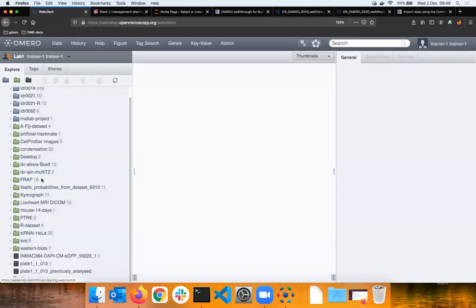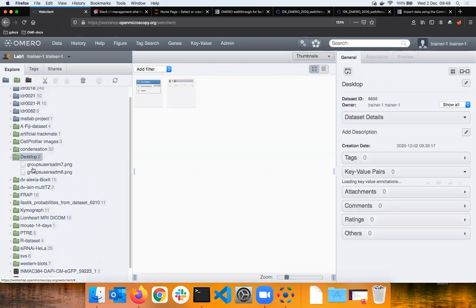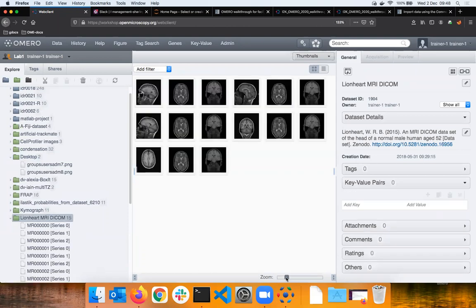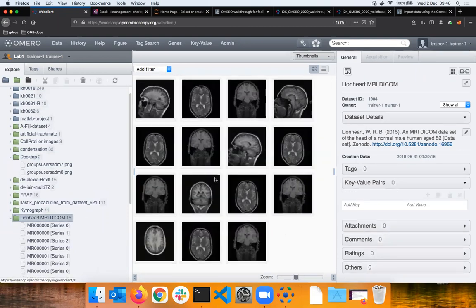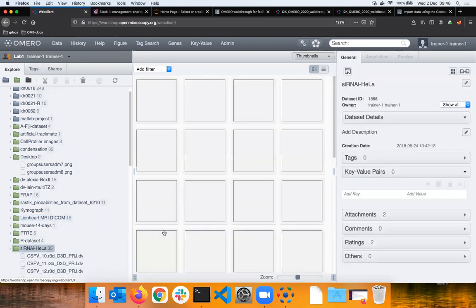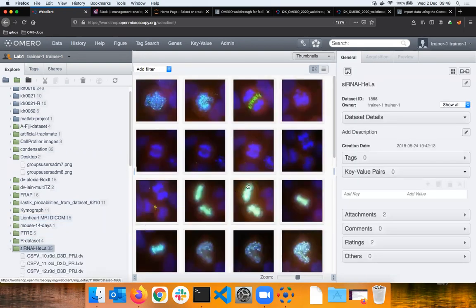And then let me go just through what we have here. So these images, by the way, were all imported in place, except for those which I just imported in front of you. They are of differing file formats. This is the DICOM, which I was showing in the presentation. Here we have some conventional microscopy images in a Delta Vision format, and there are some deconvolution images together with them, which were also imported.